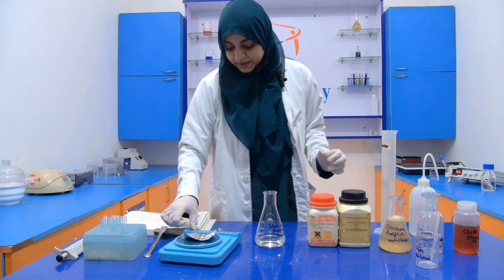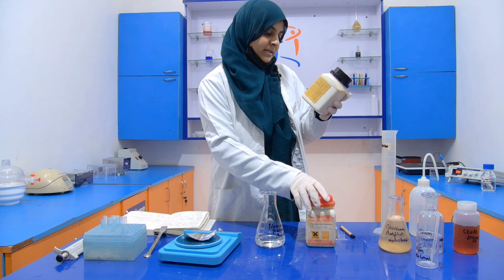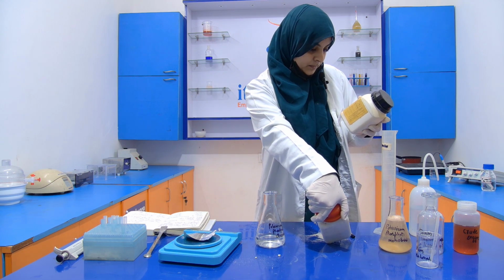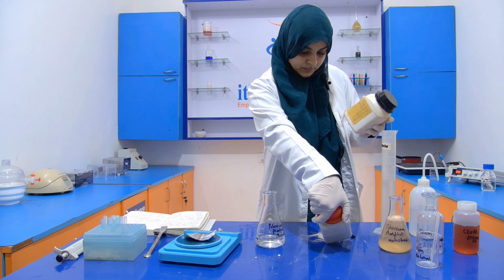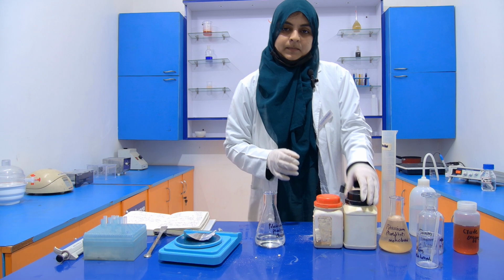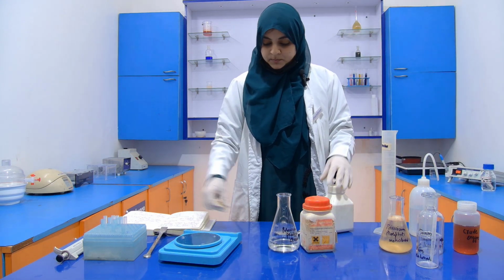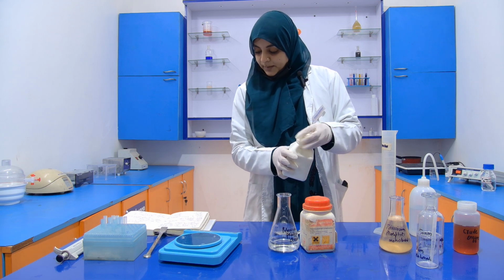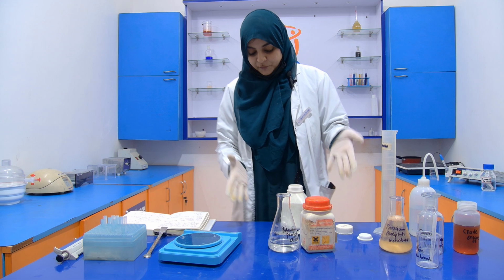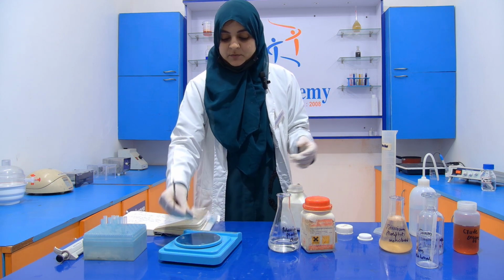Now we have to take the weight of dibasic. Now I am going to dissolve 43.54 gram of dibasic into 250 ml of distilled water.